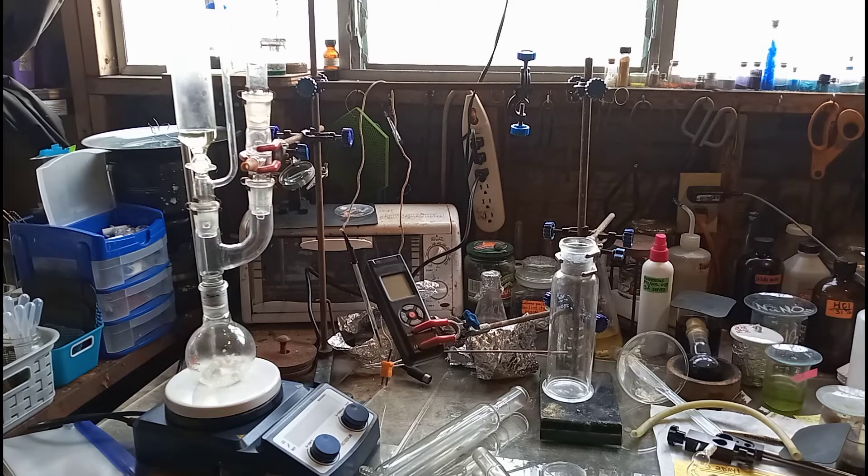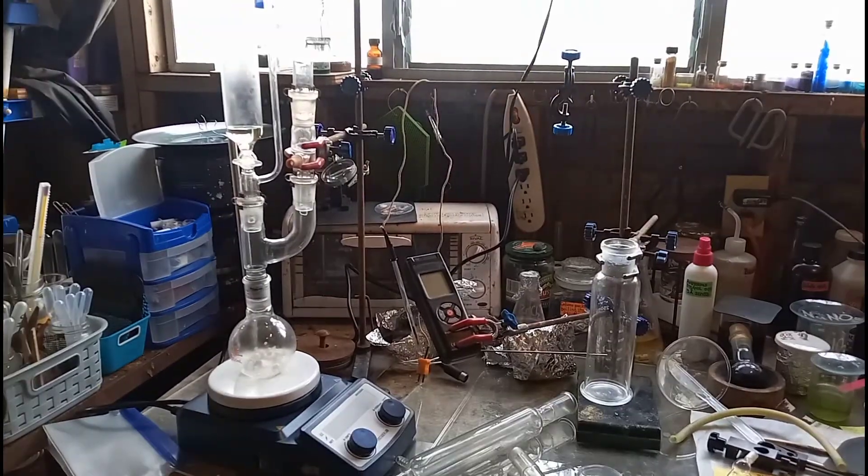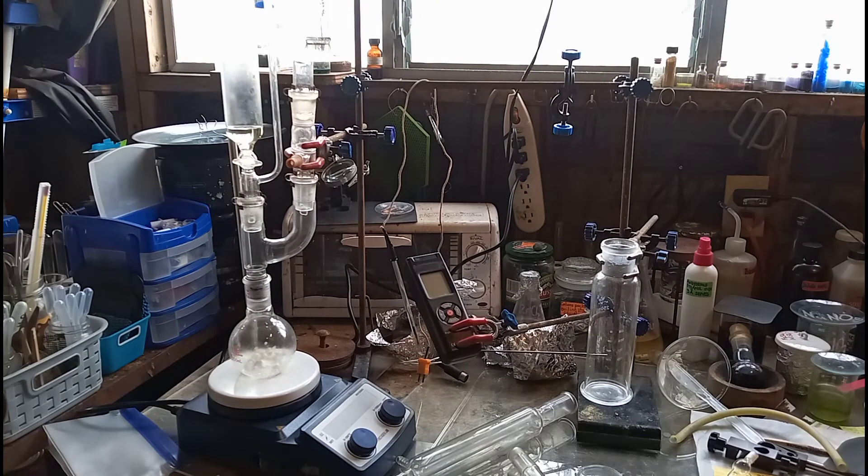I'm going to cut the camera a second, get everything set up, and then let's get rocking. One quick thing I should mention: for your joint grease for this, the Cl2 is such a strong oxidizer that you don't want to use anything but Krytox. And if you don't have that, just use a little bit of sulfuric acid — that's the best thing I could say.